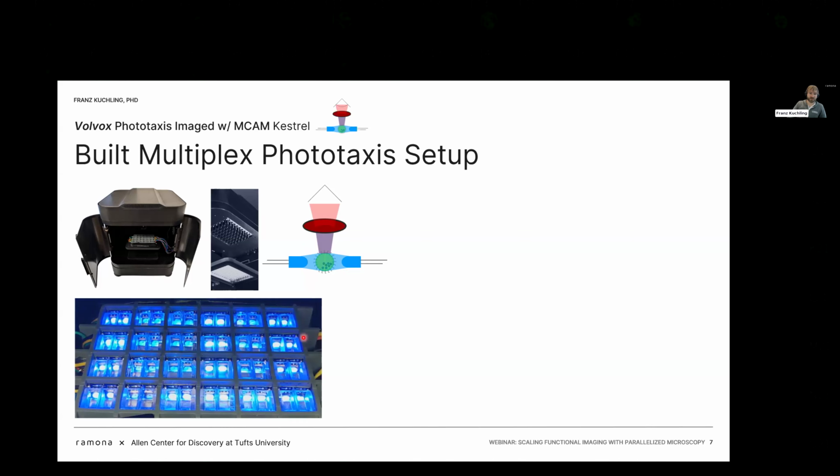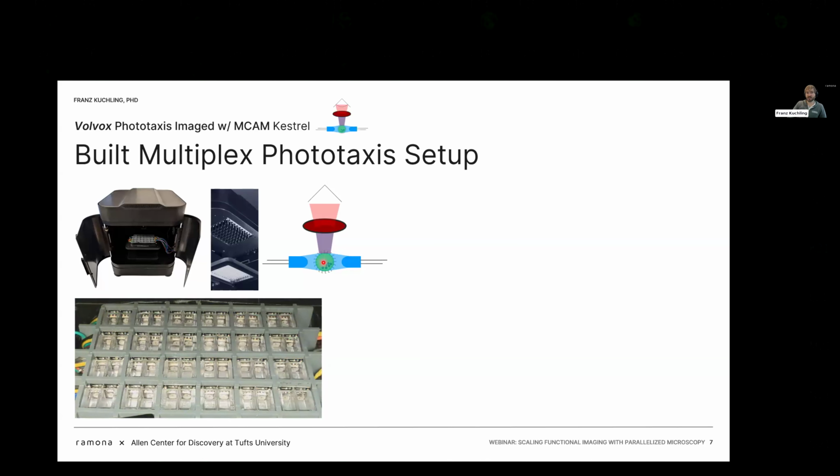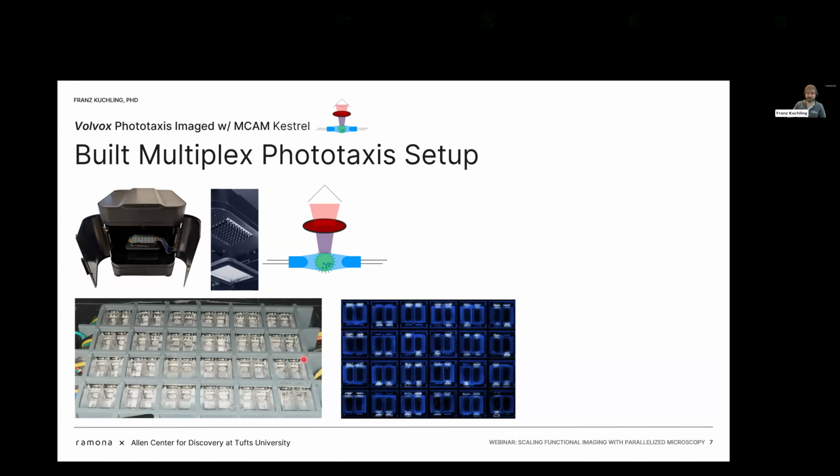And the imaging basically happens because I'm using the blue light from these LEDs as an excitation light. When I did this in a spectral microscopy setting, I noticed that they have an autofluorescent, far-shifted Cy5 channel. So we just hooked up a Cy5 filter just below the cameras, and we got a very clean signal of the Volvox that looked like this, where you have all these chambers and you see those very small green dots on the inside.